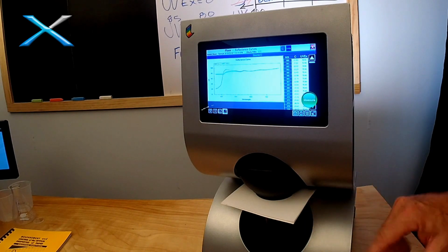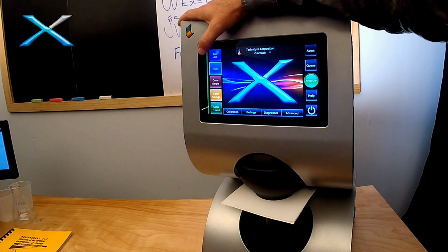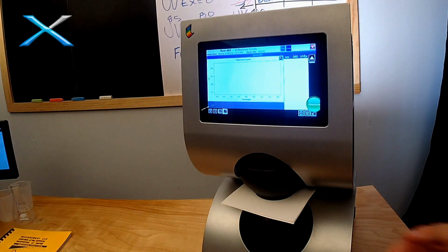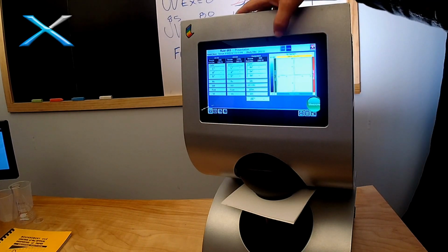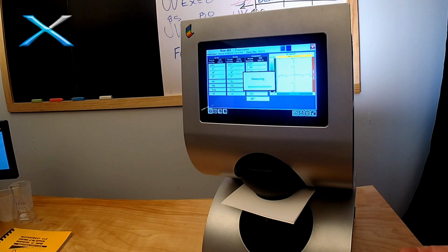Okay, so that's that sample under source C. I can close that presentation out, and I'm going to open up this second presentation, which I set up to be just like the previous one, but now instead of measuring under source C, it's going to measure under source D65. So you can see we've got D65 and UV excluded. Now I'll hit measure. Notice I didn't move the sample, didn't change the sample. It's the same exact sample measured at the same location. The only difference is now we're exciting those fluorescing agents, the optical brighteners, with a light source which is UV rich, D65. So we'll see an elevation in our numbers because of that.